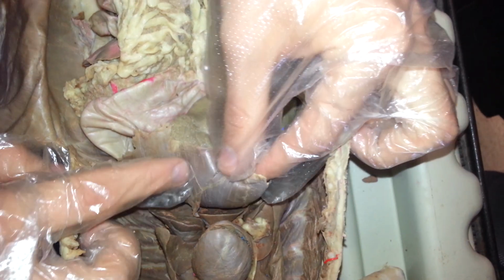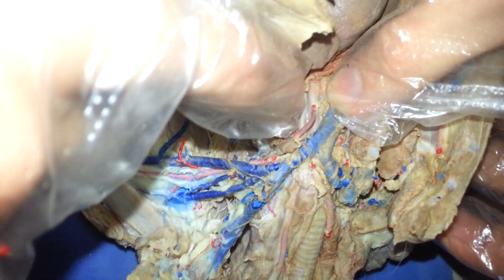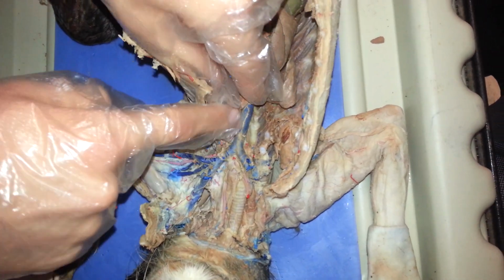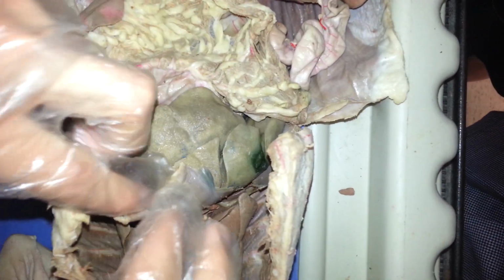The diaphragm is found right here, and it separates the abdominal cavity from the thoracic cavity. Next are the lungs, and they're going to be lateral to the heart. The aorta is below right here. It's kind of hard to see. The superior vena cava, or the anterior vena cava, is right here, this big old blue. And we're going to go down here to see the posterior vena cava, or inferior vena cava, which is right here.